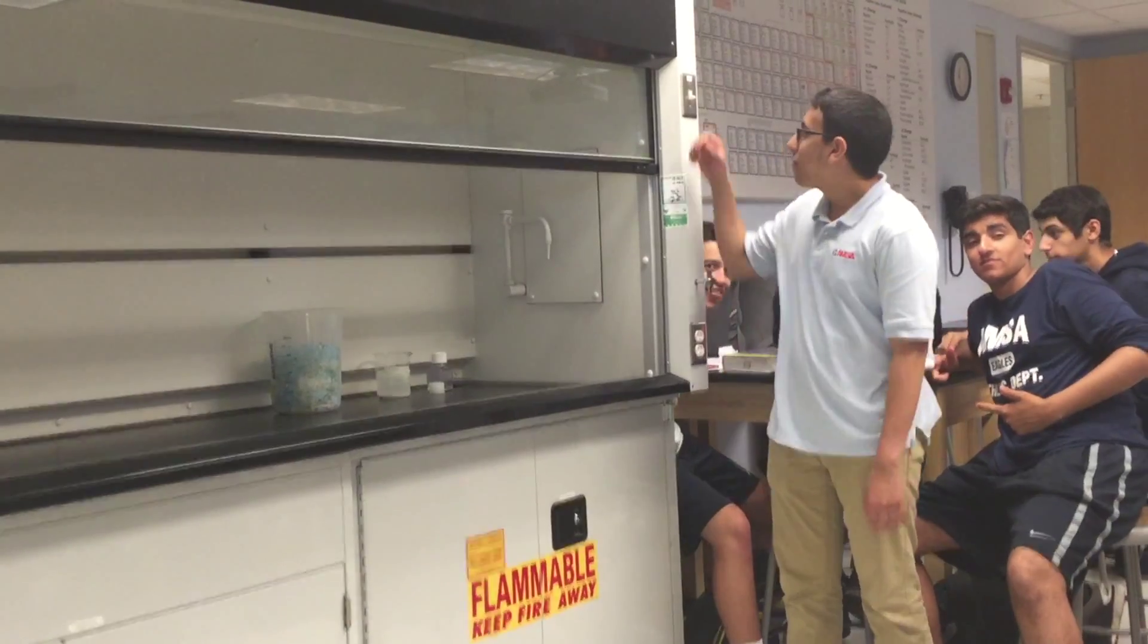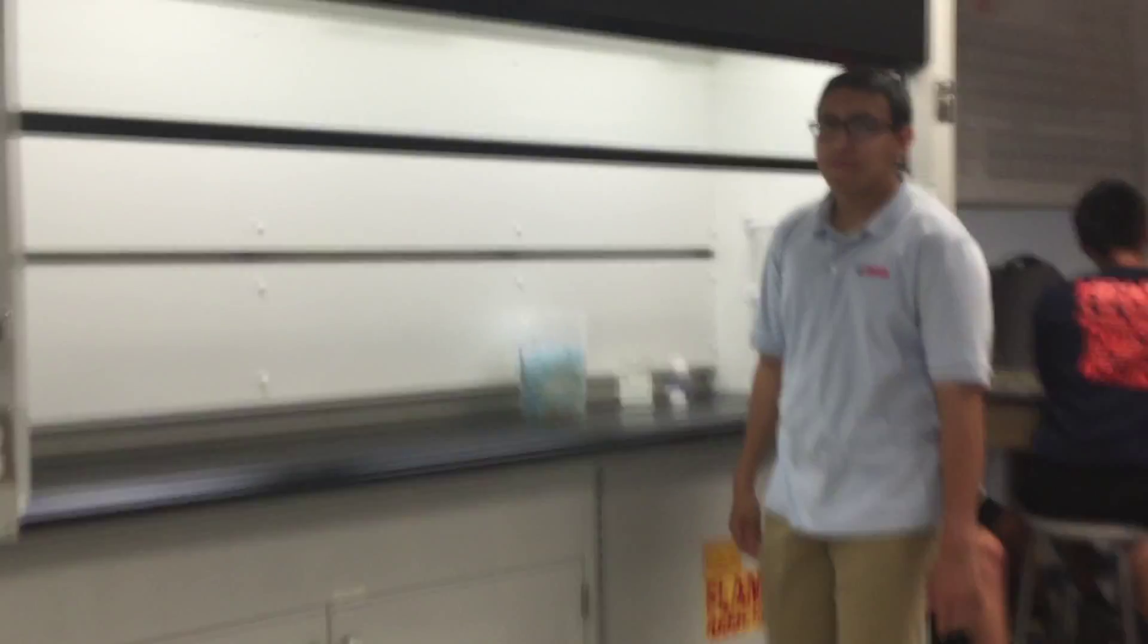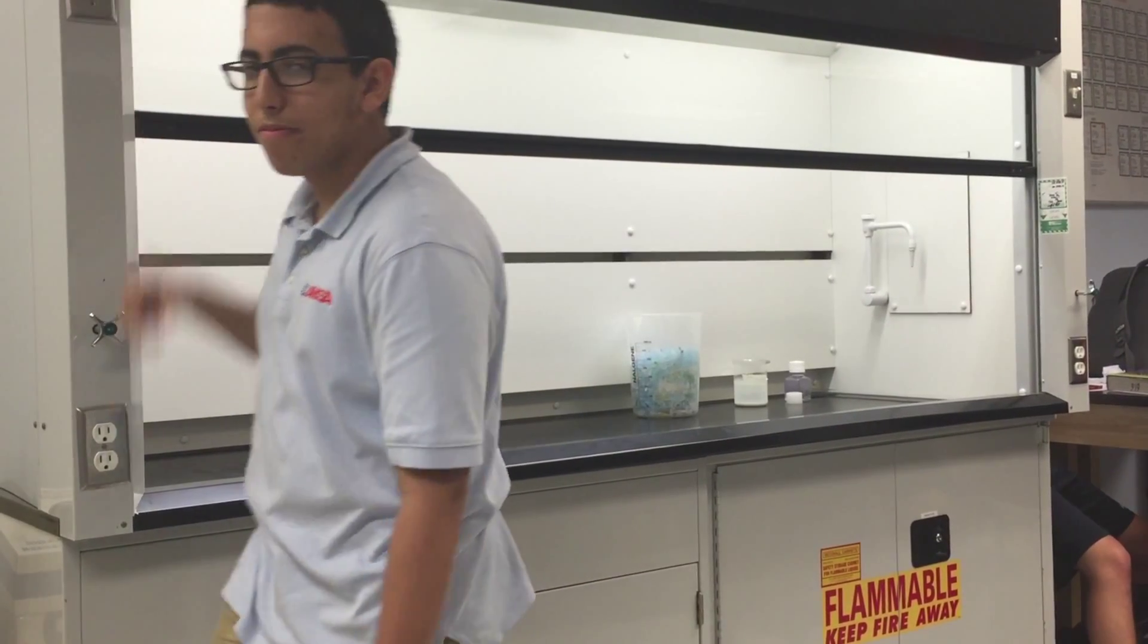Also, wear gloves to protect your hands. If you're performing experiments involving fumes or acids, make sure to do these under a fume hood.